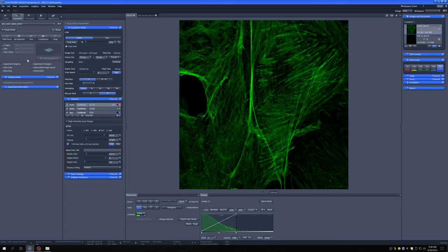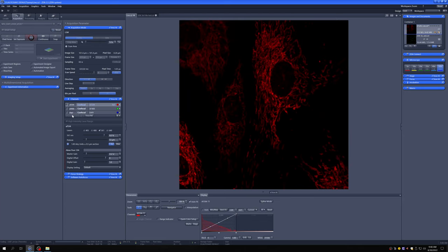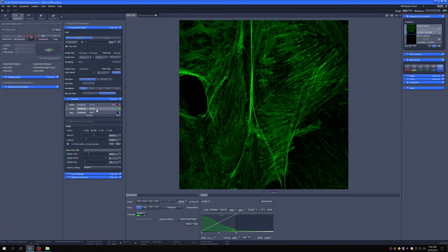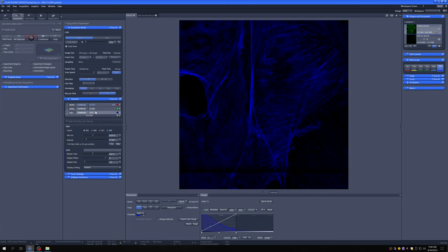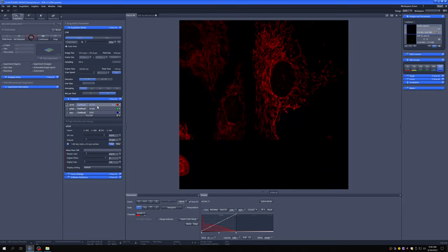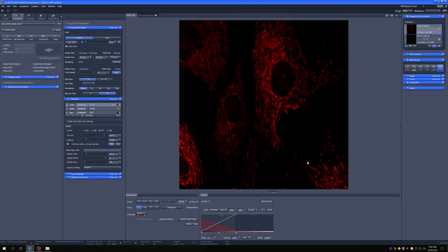Now I have the following image which we can look at. This is the mitochondria, this is the actin, and then these are the sort of uninteresting nuclei. So this is a great starting point for further optimization.